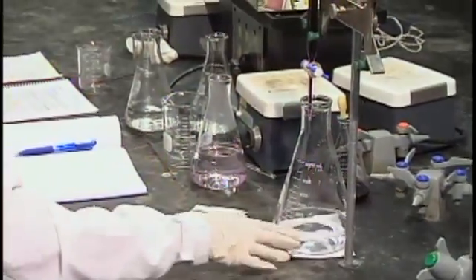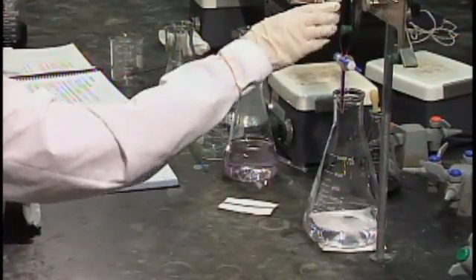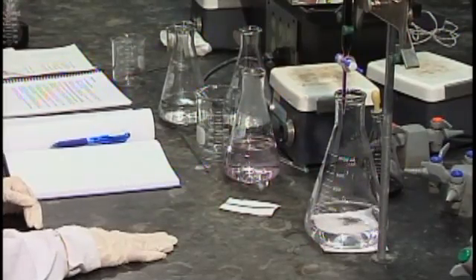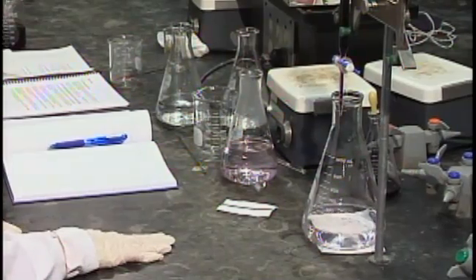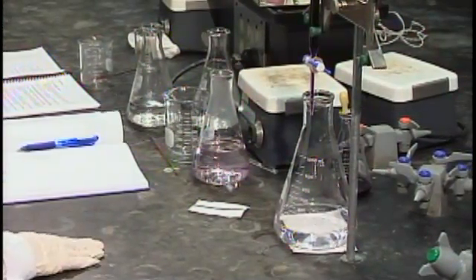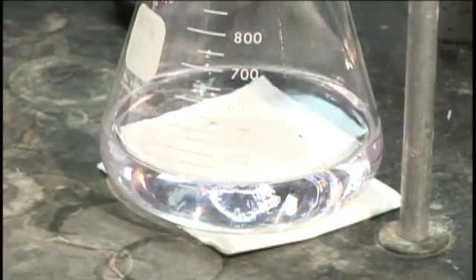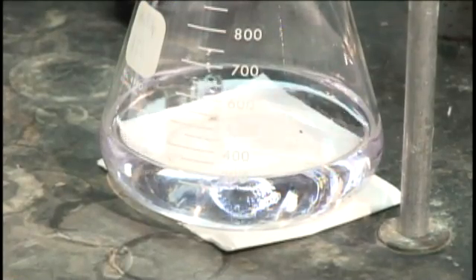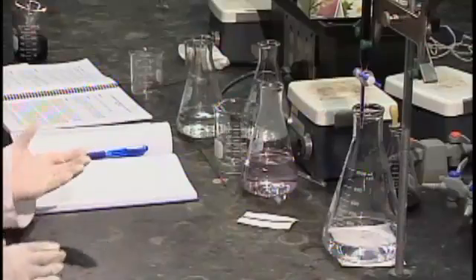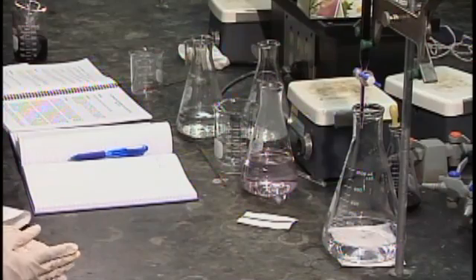So just to recap, we took our leftover 1 molar sulfuric acid and titrated it with 1 drop of our potassium permanganate in the burette, and just observed that it did in fact change color, so we can correct our endpoint to adjust for that. And the rest of your lab is to titrate your iron ore, and you're going to follow exactly the same procedure as you did for this, except with your second sample. And don't forget to record your initial point and your end point.